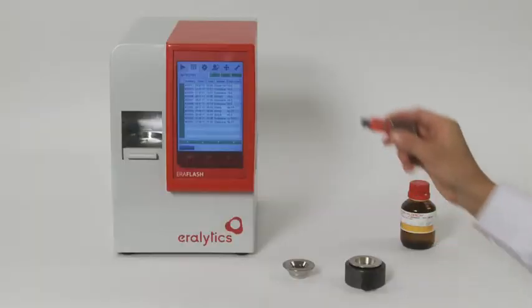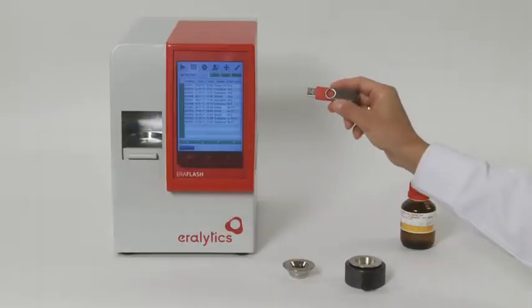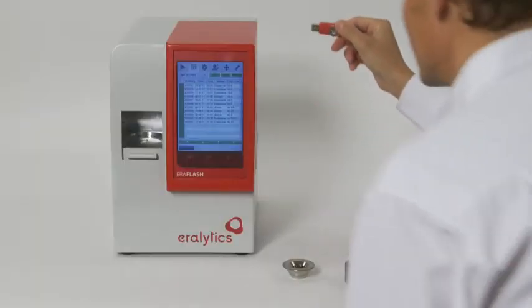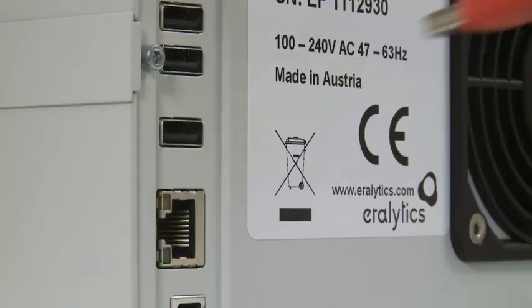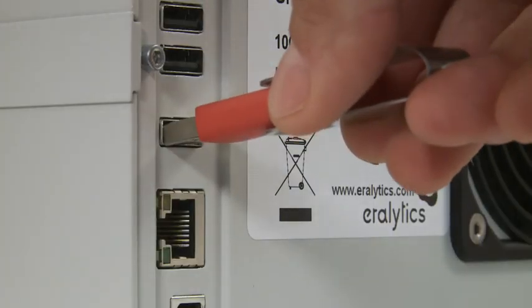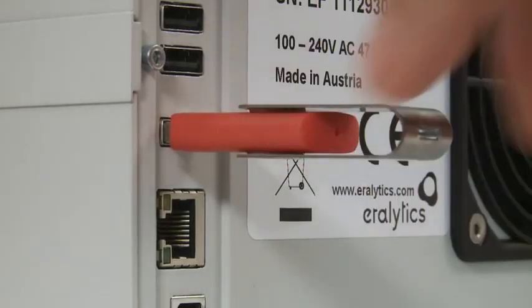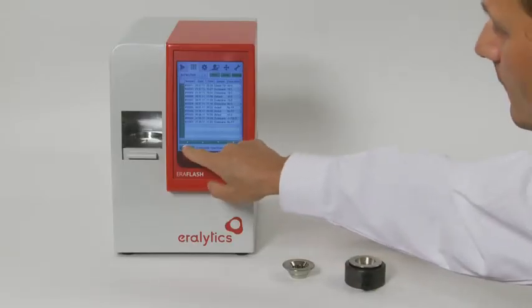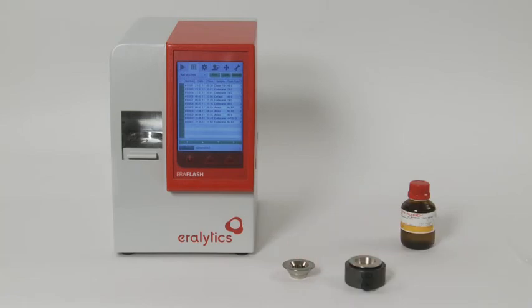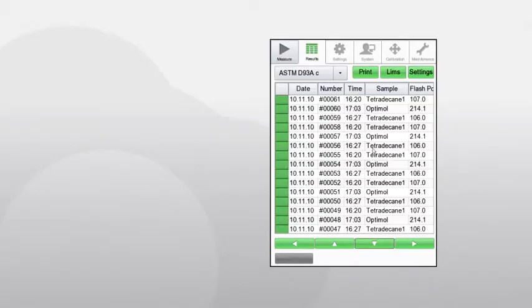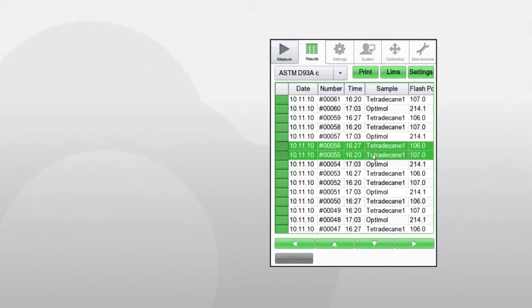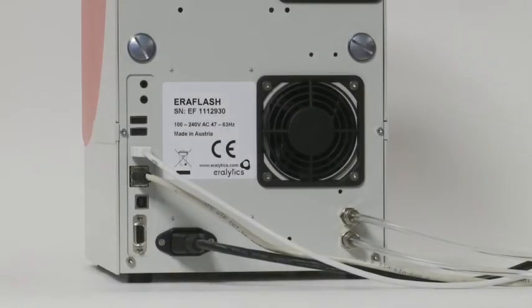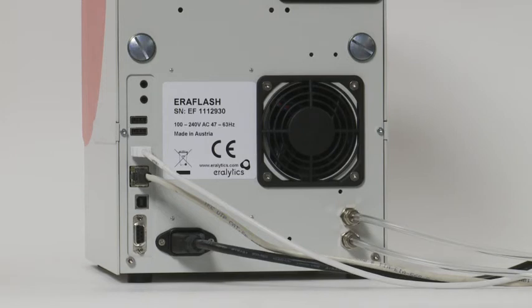A file containing all results can be stored on a USB flash drive for storage on a PC or review in MS Excel. A very convenient alternative is the automatic transfer of the data to a LIMS system. There is no software required—just connect the instrument to the local area network via the built-in Ethernet connection and define the folder and file name where the results shall be stored.